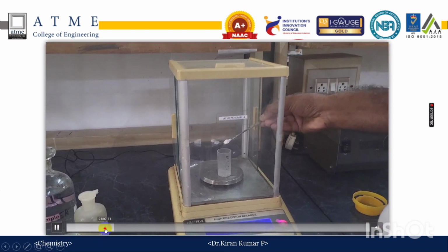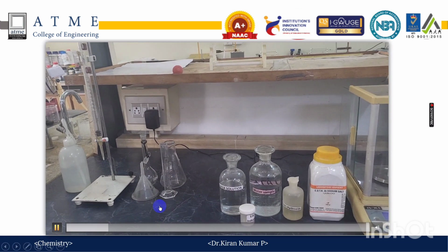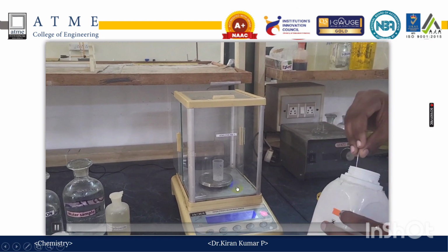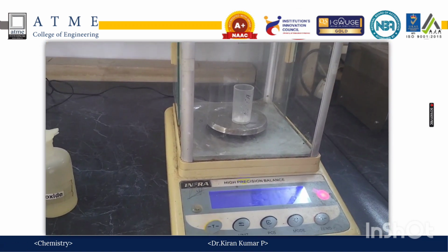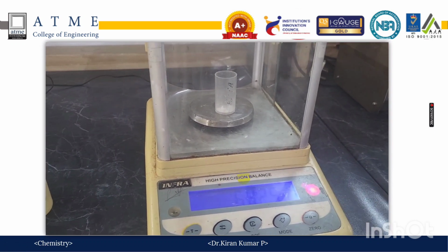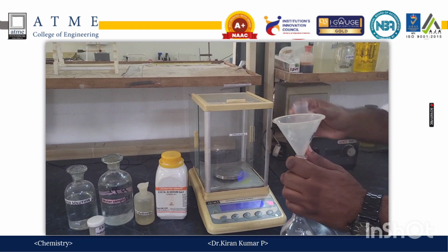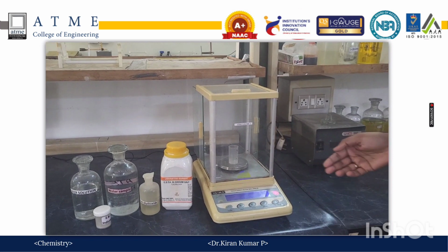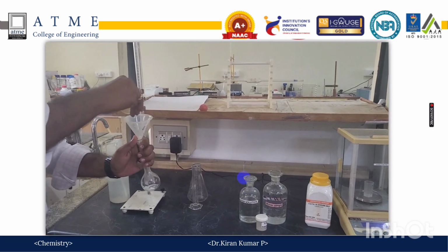After washing it thoroughly, the estimation of total hardness of water has two parts, part A and part B. Part A is the preparation of a standard solution of disodium salt of EDTA. In order to do that, weigh a known weight of disodium salt of EDTA. Note down the weight of salt plus weighing bottle in the observation provided. Transfer the salt into the standard flask and note down the weight of the empty bottle. If you subtract these two, you get the weight of salt transferred.